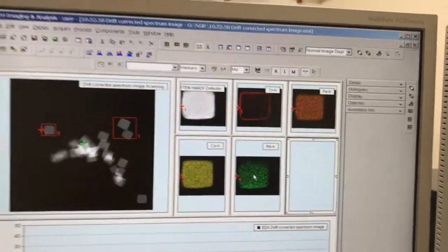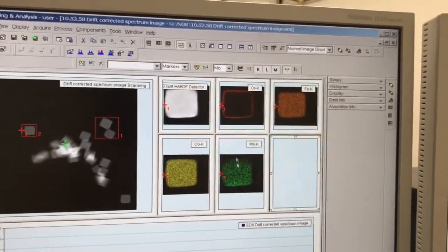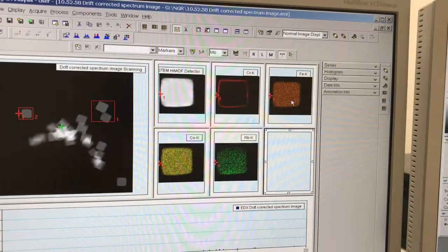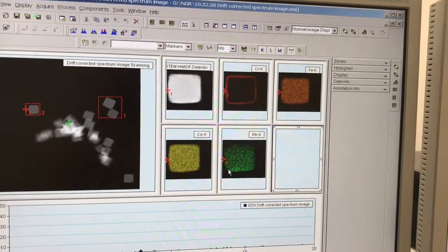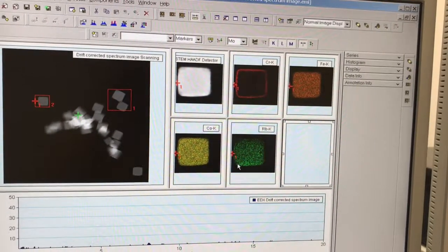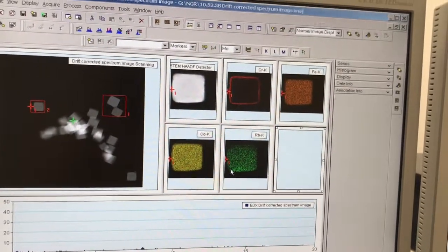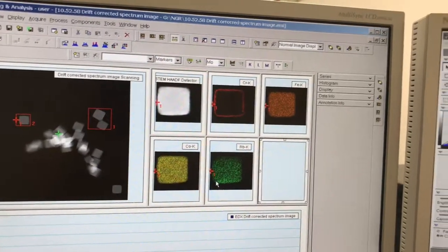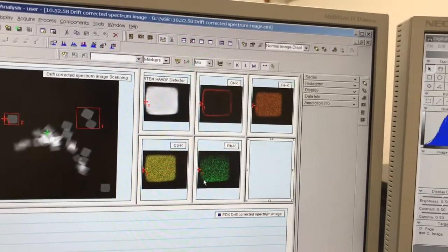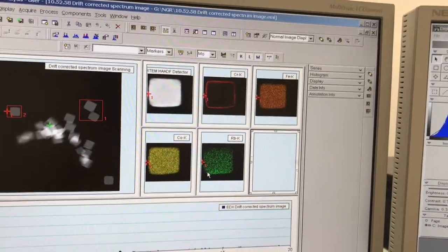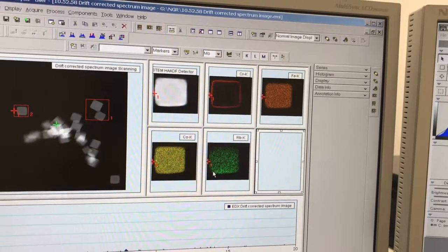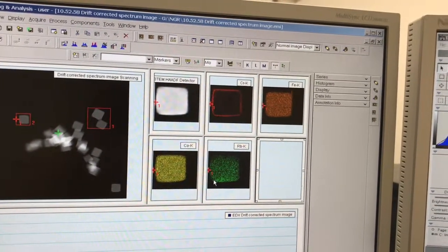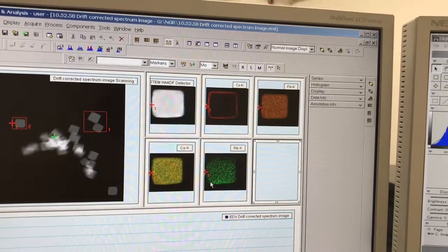One unfortunate drawback of TIA is that it will not make a composite spectrum image — where all of the maps are overlaid so you see the individual colors spatially oriented with respect to each other. We can't do that in TIA, but it can be done easily using ImageJ, and that's what we'll cover next.